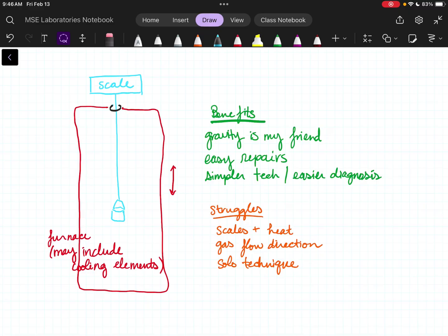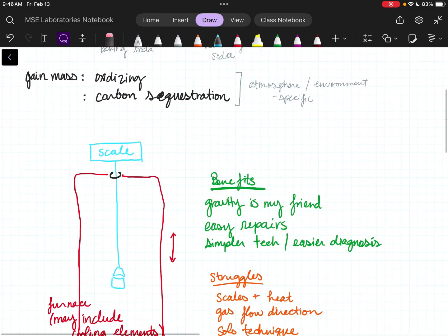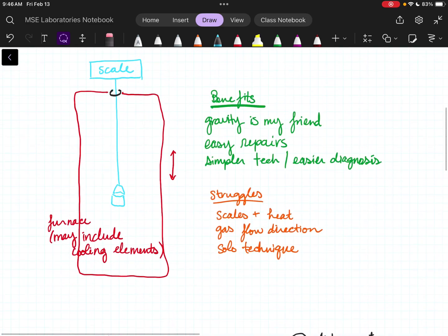Especially when we've just replaced the beam arms. But a weight calibration, we do 1 empty and 1 weighted. It knows that it's empty when it's empty, and it knows that it is weighted with a specific weight when it runs the weighted version. So it knows what it should be reading, and it can calibrate to those. So that's 2 ways that we can minimize the buoyancy effect.